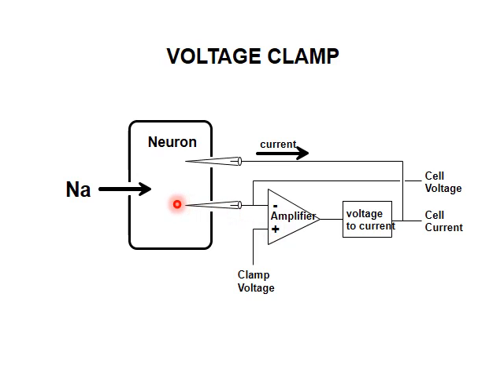Now the cell is still sitting at minus 80, so minus 80 is going into the negative input. We now have 0 going into the positive input, and this results in a large positive voltage coming out because there's minus 80, which is inverted by the negative input. So a large positive voltage comes out of the amplifier. This is converted to a large positive current, which is injected into the cell, and very rapidly, in less than a millisecond or even 100 microseconds, the voltage inside the cell is raised from minus 80 to 0.